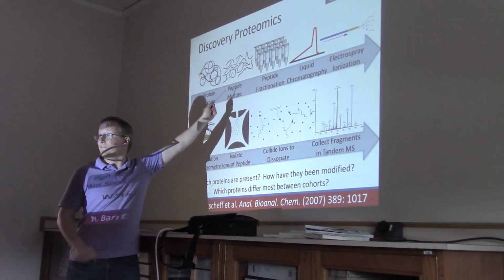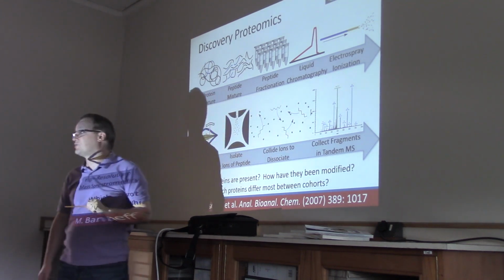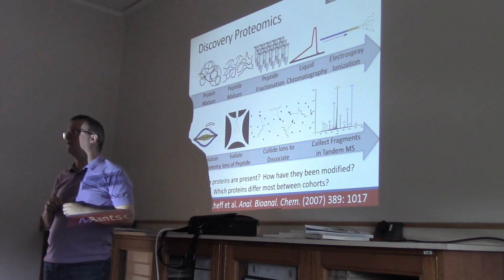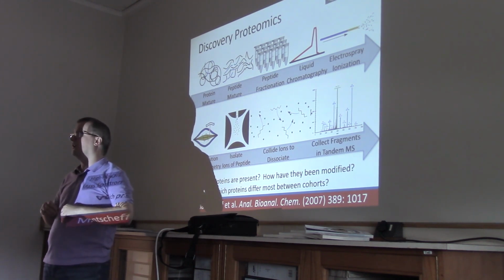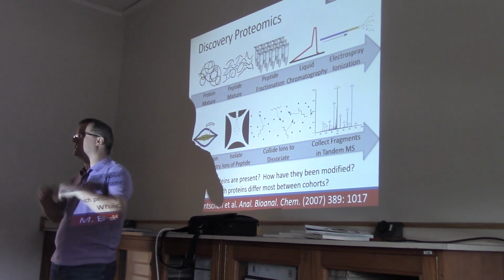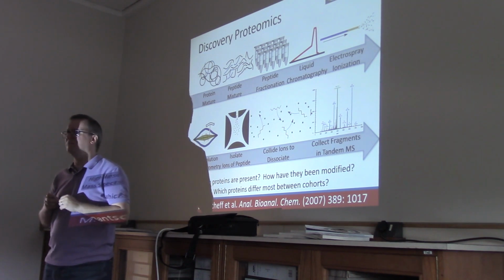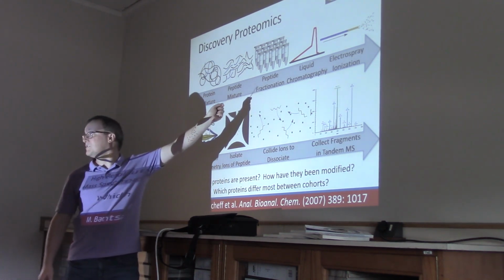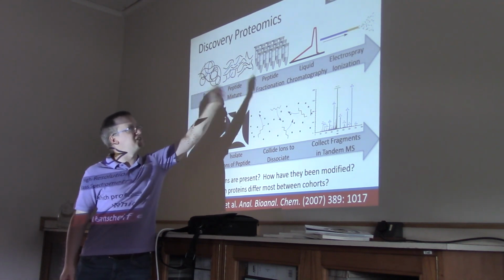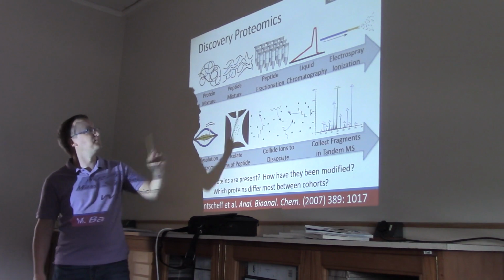So we might fractionate these 100,000 odd peptides into different fractions on the basis of isoelectric focusing, or on the basis of, there are lots of different methods that we use for this. Strong cation exchange, affinity, stuff like that. Lots of different ways. So these 100,000 peptides have now been separated into mixtures that maybe contain 10,000 peptides apiece.